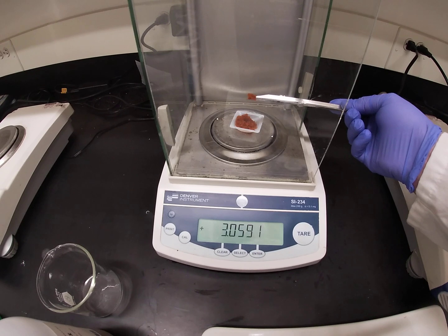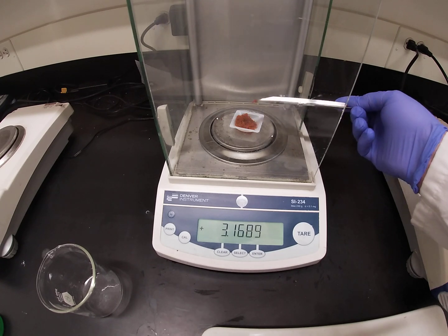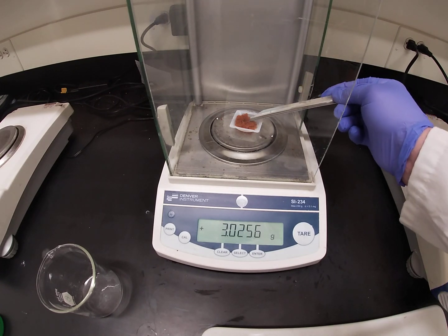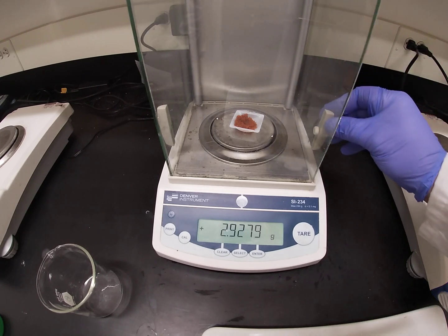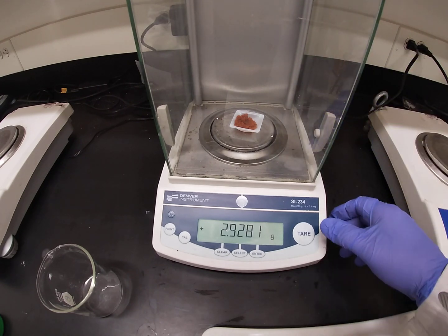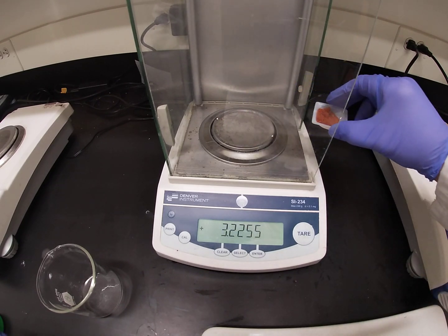Whoa, too much. That was pretty good — not enough. There we go. We are going to call that a wrap: 2.9281 grams. Record that number and we will proceed.